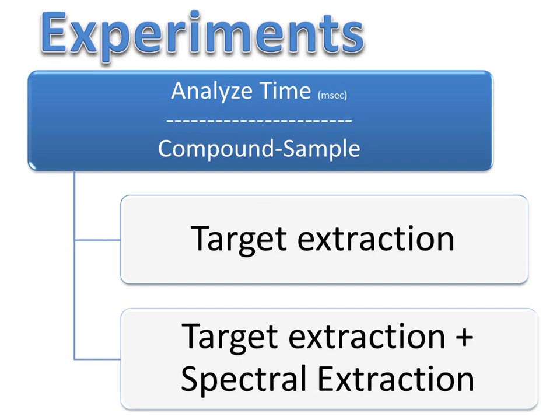And the other case is the combination of the target extraction with the spectral extraction. So you're going to see the relative performance and the cost of adding in a saturation-aware spectral extraction to complement your target quant results and also provide you with that spectral confirmational evidence.